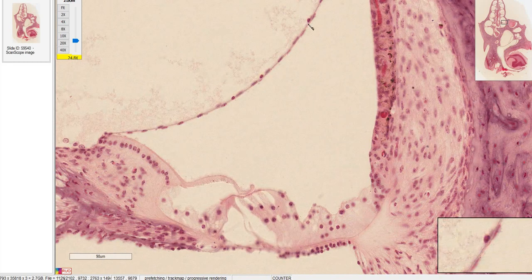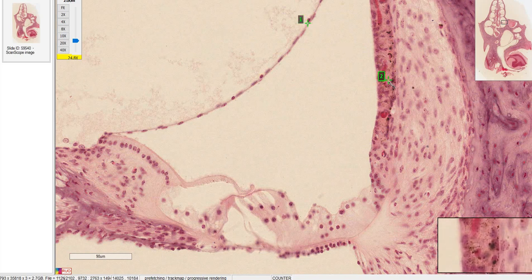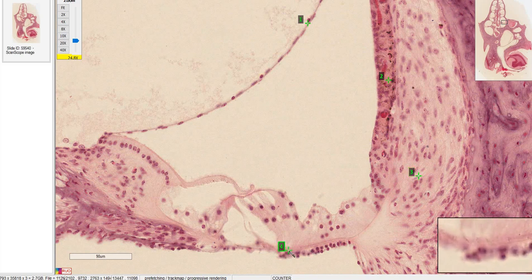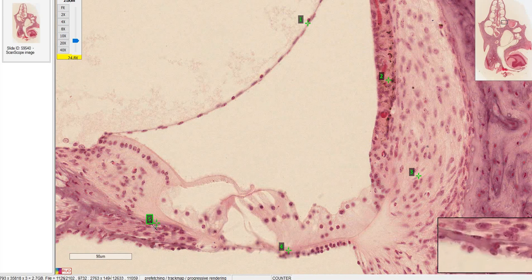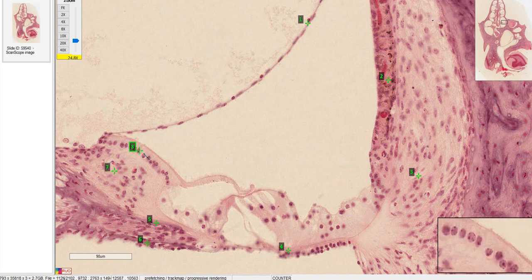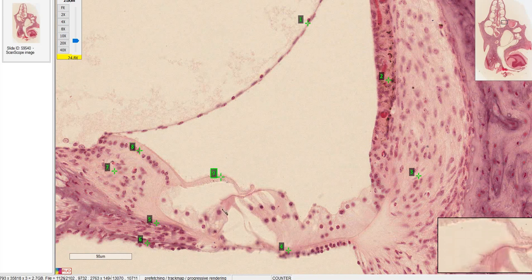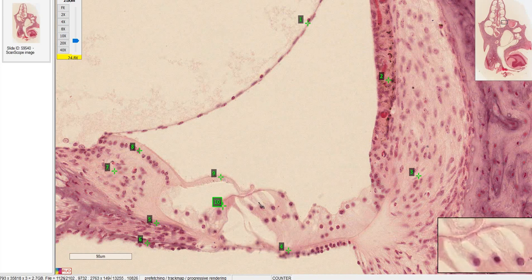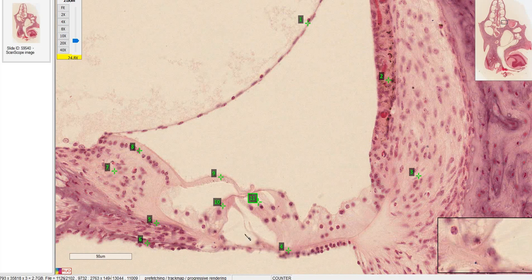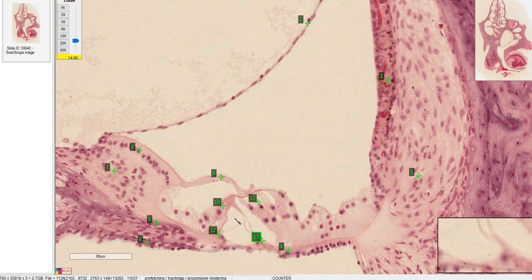Going in the same order: 1 is Reissner's membrane, 2 is stria vascularis, 3 is spiral ligament, 4 is basilar membrane, 5 and 6 are the two shelves of the osseous spiral lamina, 7 is the spiral limbus, and 8 is the epithelium of the spiral limbus which secretes the tectorial membrane. 9 is the inner hair cell, and the tectorial membrane is attached to the stereocilia of number 11, the outer hair cells. 12 and 13 are the pillar cells making the lumen of the tunnel of Corti.